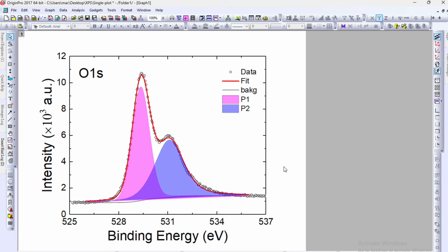I will show you how to plot deconvoluted XPS spectra using Origin software. We will consider an example of O1S. The deconvolution of this XPS spectra is performed using XPS Peak Fit software.